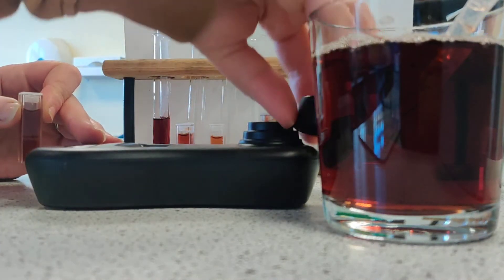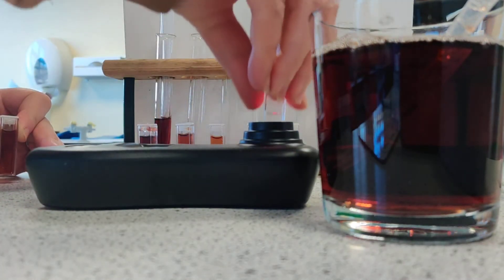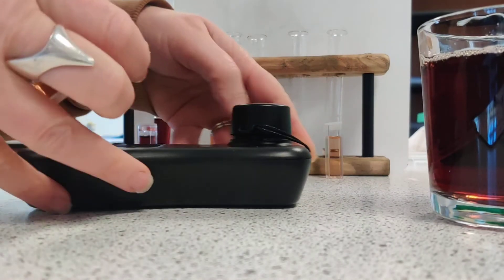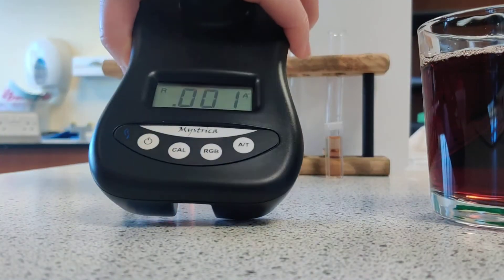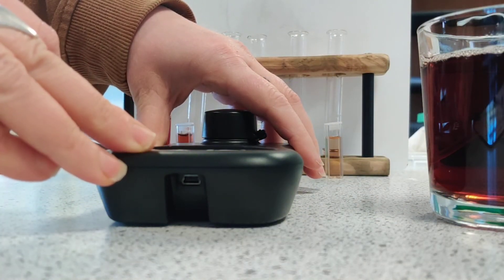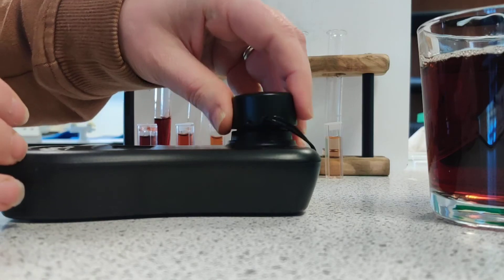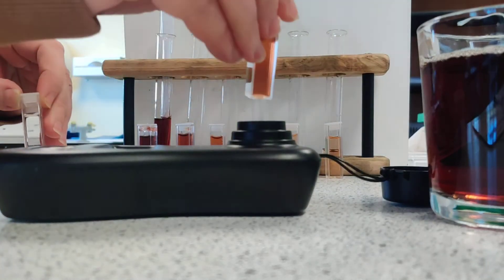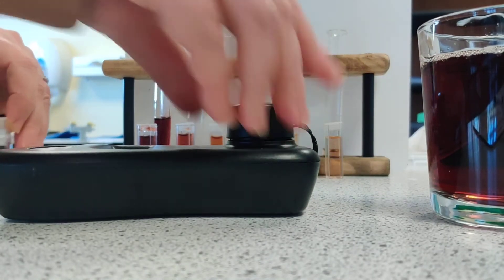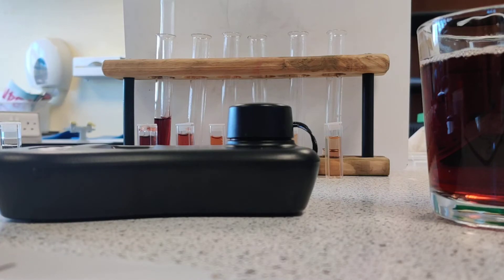Make sure the colourimeter is on. The last one I did was the most concentrated — that was 100%. I'm just going to recalibrate by putting the distilled water in there. It still reads zero. Just recalibrate that again. And so our last one is the actual juice sample, and the reading on here is 233. I'm going to write that down on my results table.